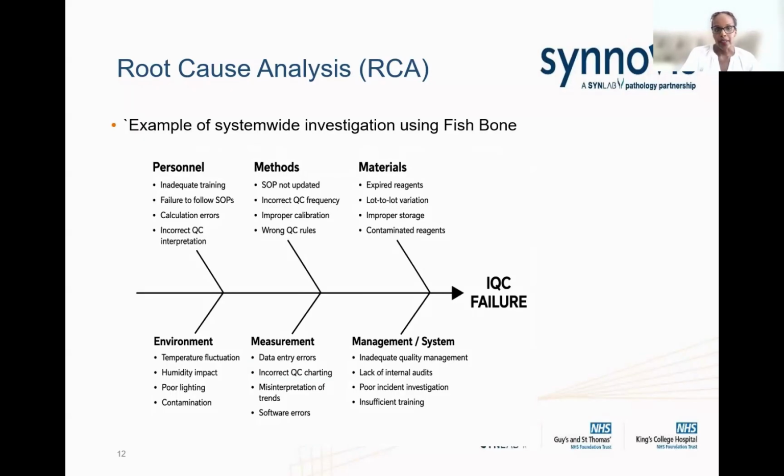So any significant errors that you identify should be logged into your QMS system, so we can identify trends on how many times these things are happening. I see lots of labs often have a spreadsheet where they log minor errors. So if there's nothing that needs to be investigated, they will often also log it there to check how many times these are happening, whether it actually needs to be investigated further, and then it's raised in your QMS system.